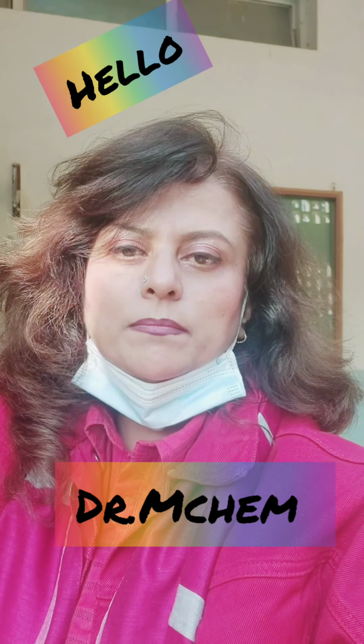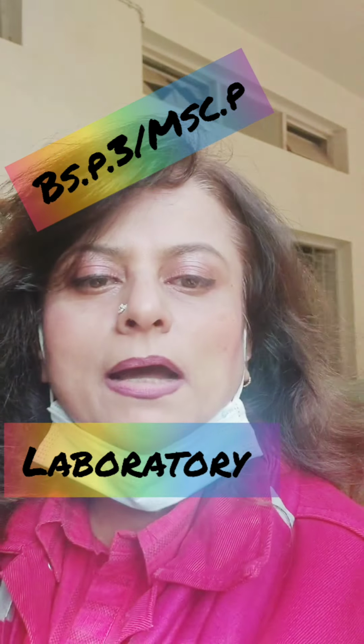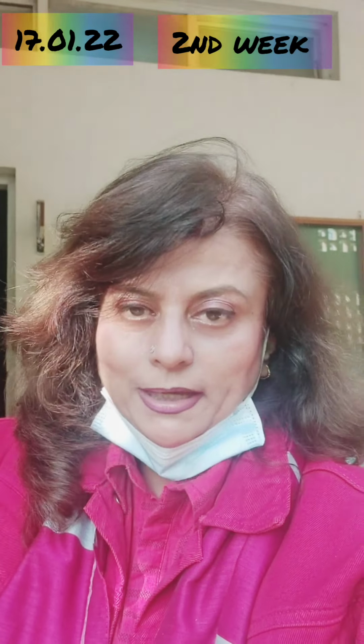I'm here in front of my lab, BS Part 3 and MSc Previous lab. Today is the first day of my students' actual performance in the lab. Now they are going to perform the experiment.